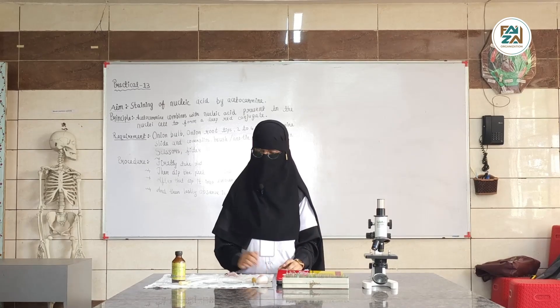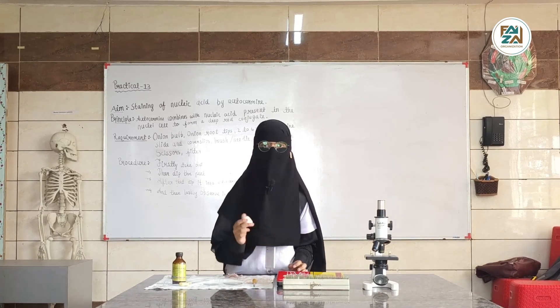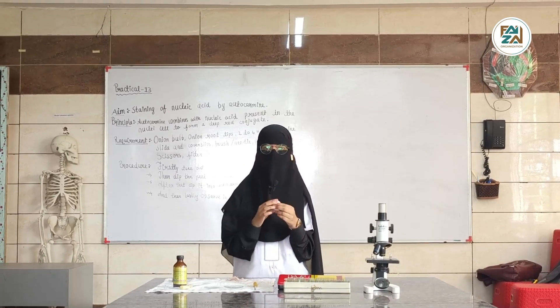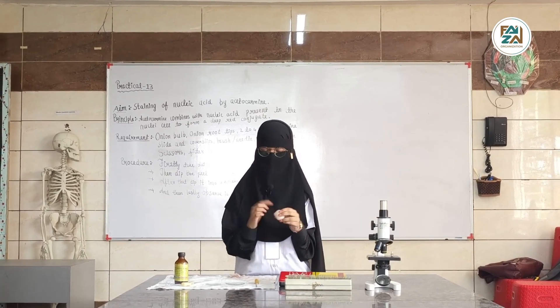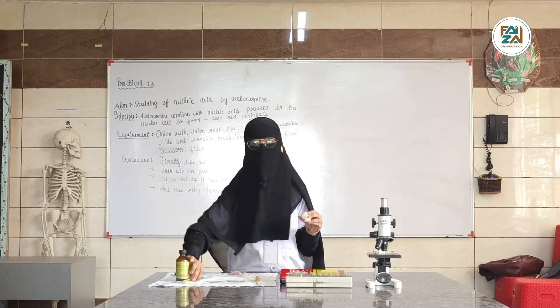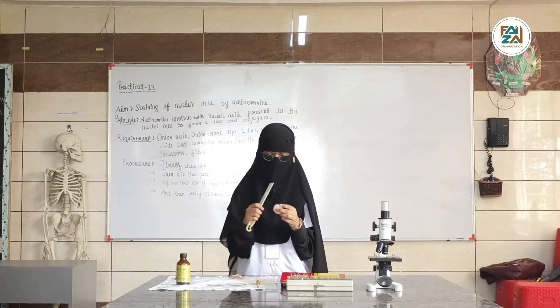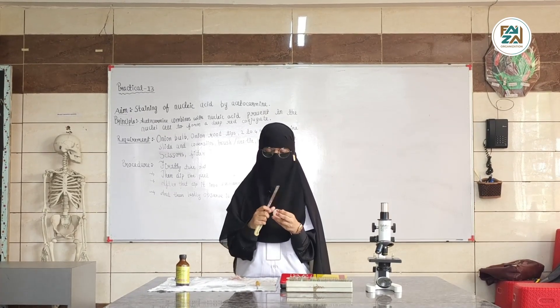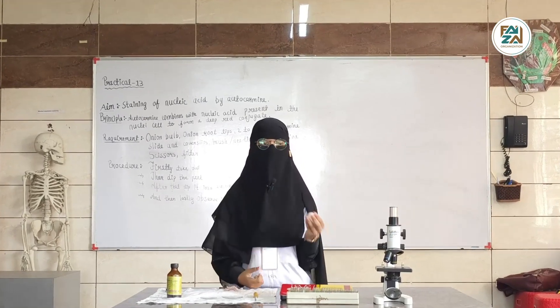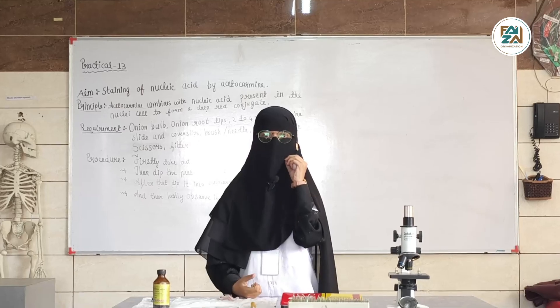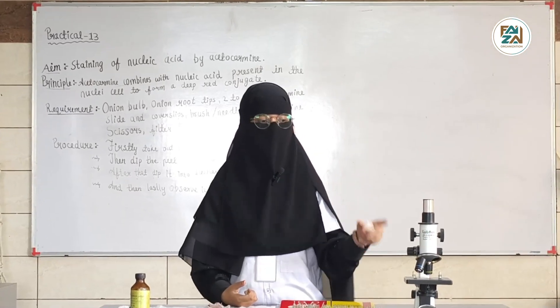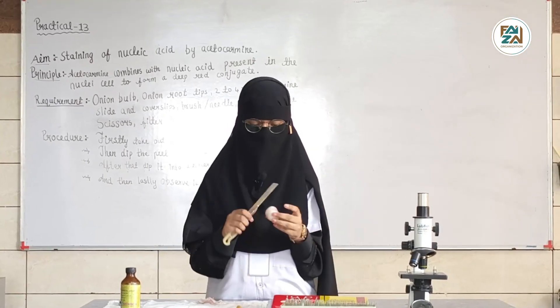Now I am going to proceed step by step on how to stain nucleic acids in an onion. First I have to peel this onion so that I can more closely see the nucleic acid under a microscope.